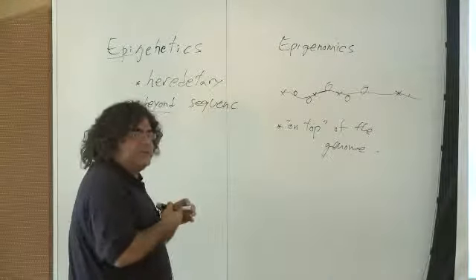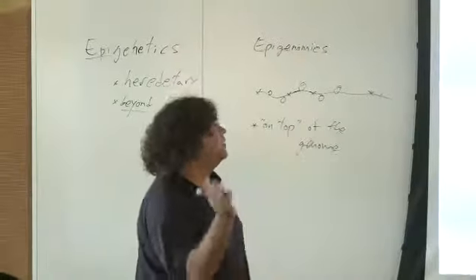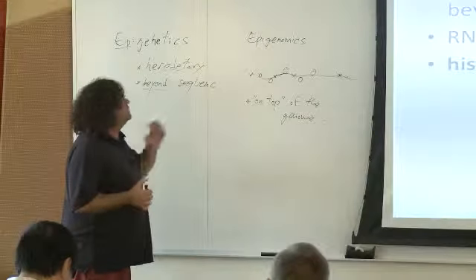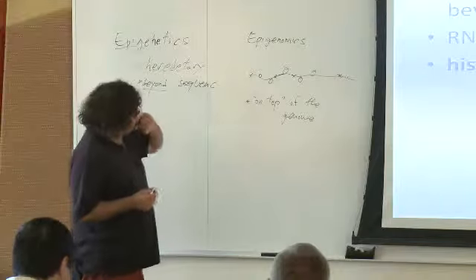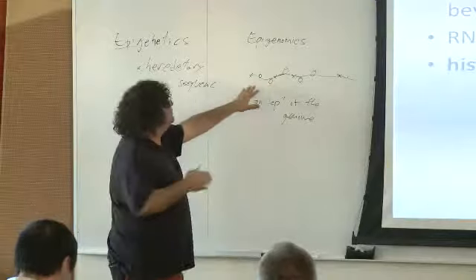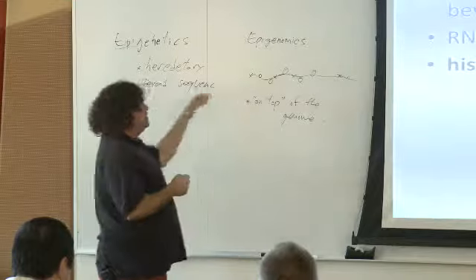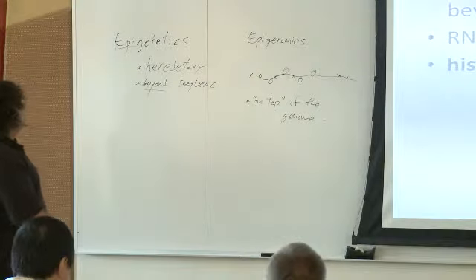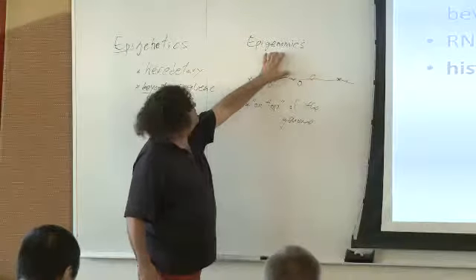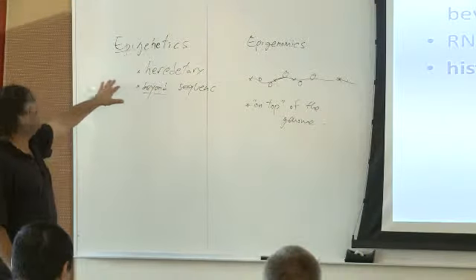So what we really study with the ChIP-Seq methods, right, we have some part of the process, I'm going to go over it very quickly again, and Chuck already talked about it, that has to do with enriching, so finding the parts of the sequence that carry some molecule that we care about, and then figuring out what these bits are. And that's what we do in our production group, with a lot of thought about this. Whatever we find that is epigenomic is part of epigenetics as well.